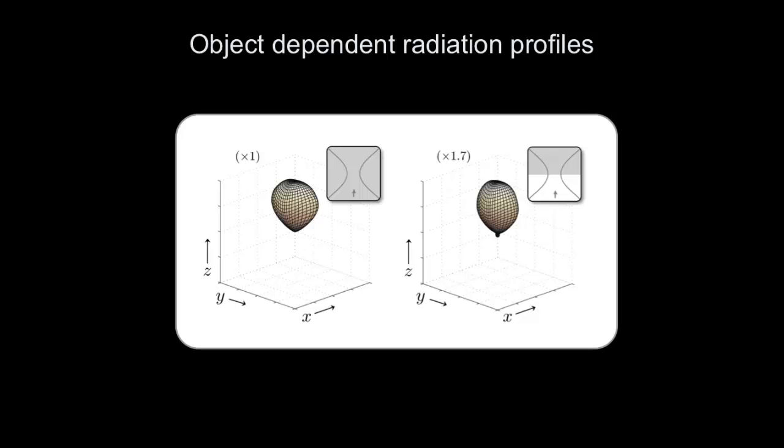It complicates the story quite a bit. In fluorescence, the light is isotropically distributed and is directly proportional to the concentration of the molecules. Here, very different. Here I have to look at the wave interference. And it leads to very interesting emission profiles. And you can understand that if you have scattering coming into the mix here, it becomes even more complex, because this depends on the phase distribution of the focal volume as well.